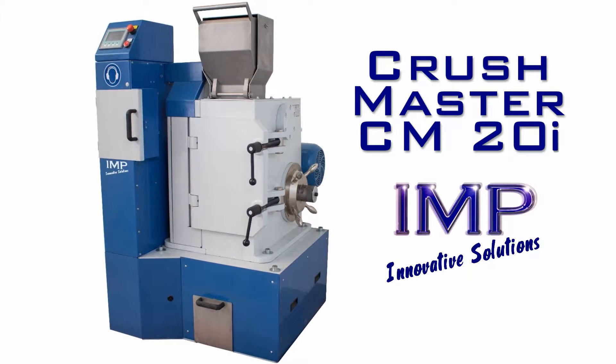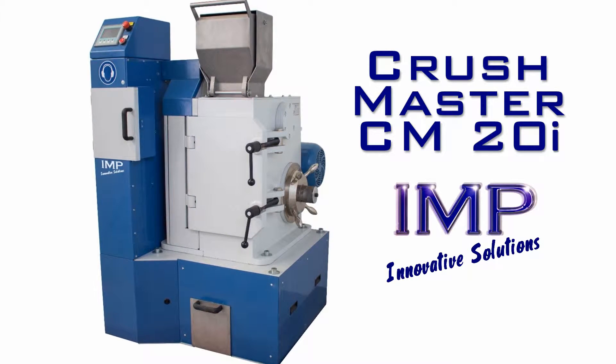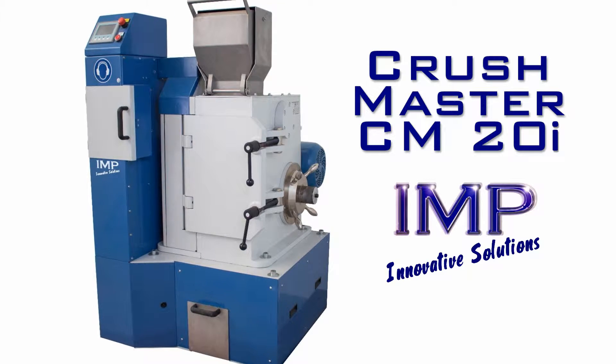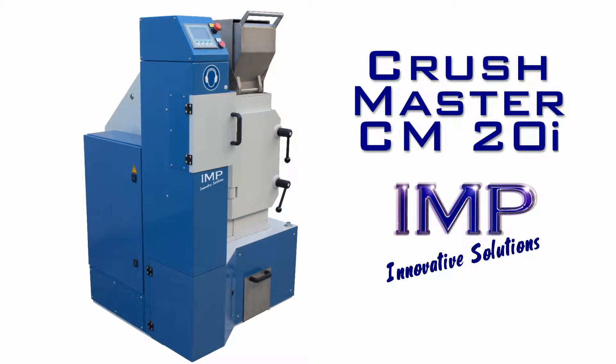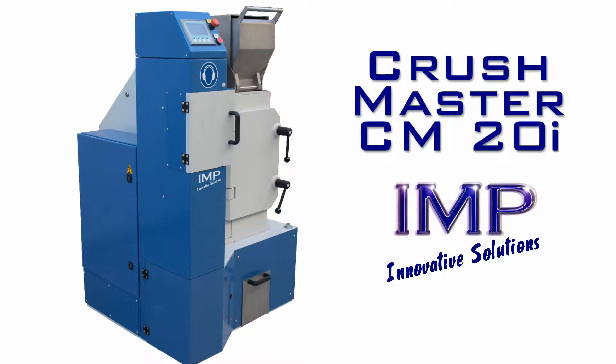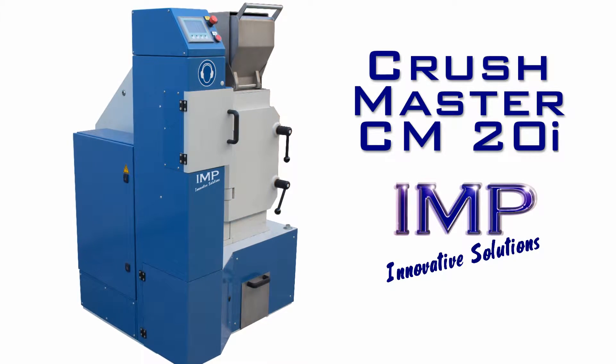The CM20i is a powerful yet compact solution for crushing and splitting pre-weighed samples. It features a networked balance connected to a heavy-duty jaw crusher and adjustable sample splitter that outputs a constant mass regardless of the input size.